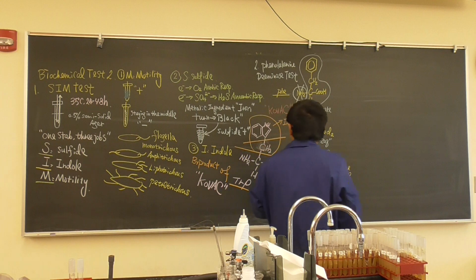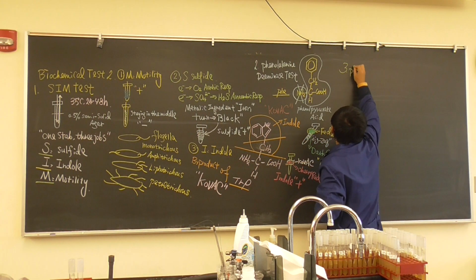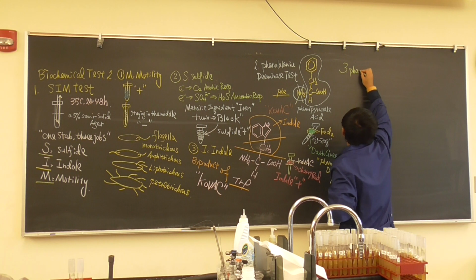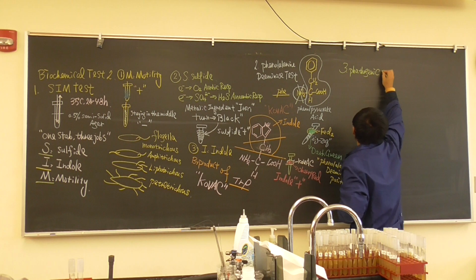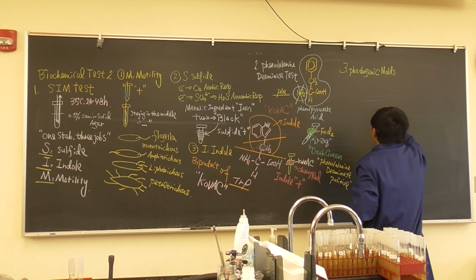Okay, another one we want to talk about is pathogenic molds, and we need to know a little bit.